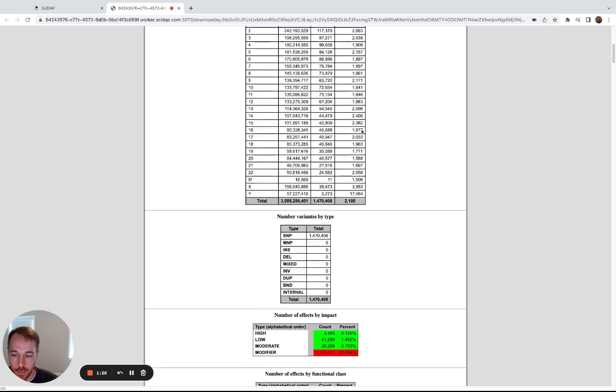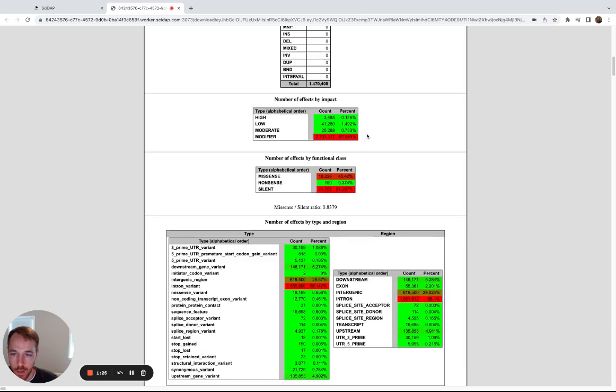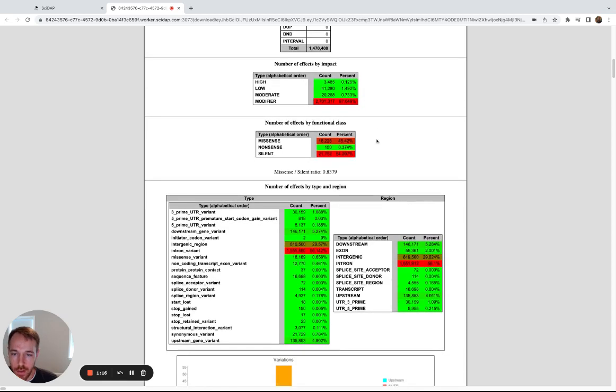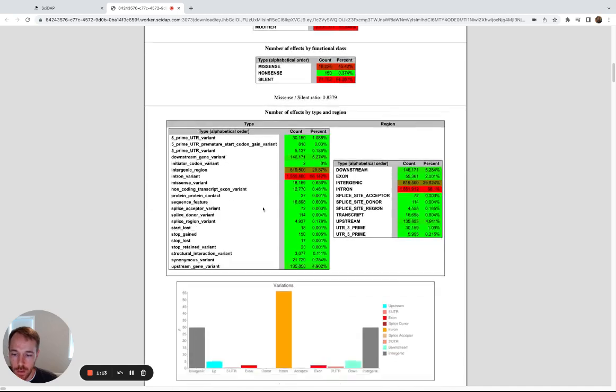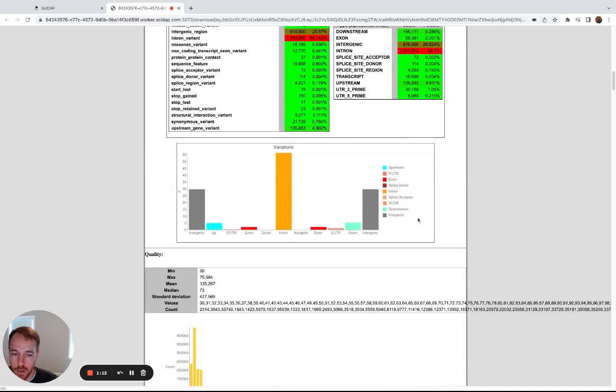This one breaks it down by chromosome. It gives you kind of a summary of the impact, broken down by percent of the variants that were identified, as well as broken down by functional class, type and region.